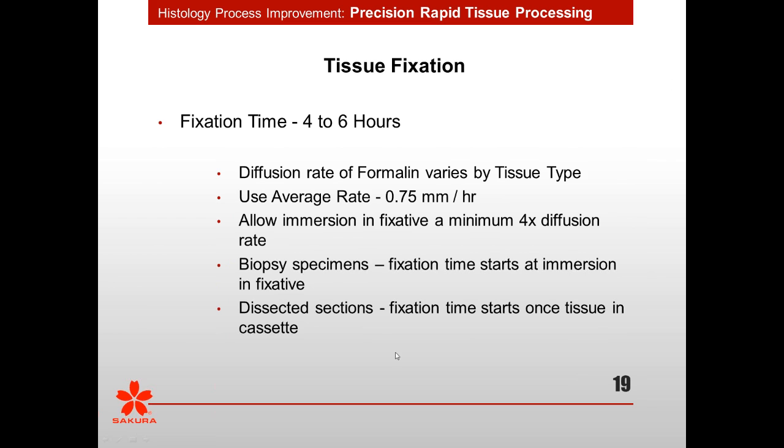Fixation time. So here's the controversial part, 4 to 6 hours. A lot of samples go through. What I think we're really looking at is the diffusion rate of formalin. Is it getting through, diffusing into and stabilizing your tissue? So basically, you're looking at antifreeze moving through your tissue when we look at a buffered formalin.